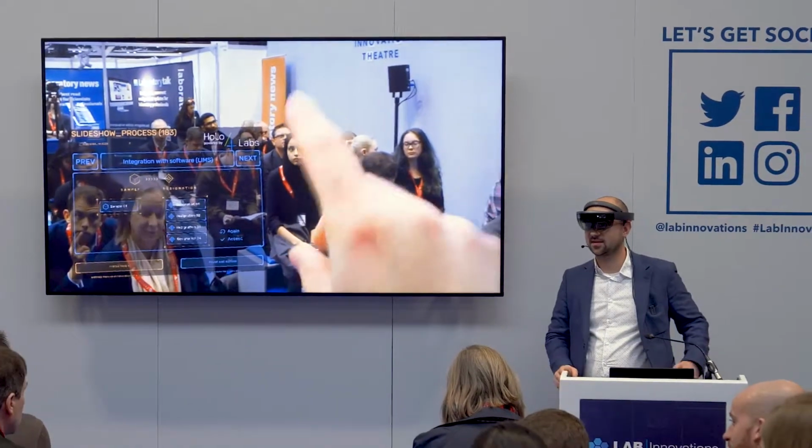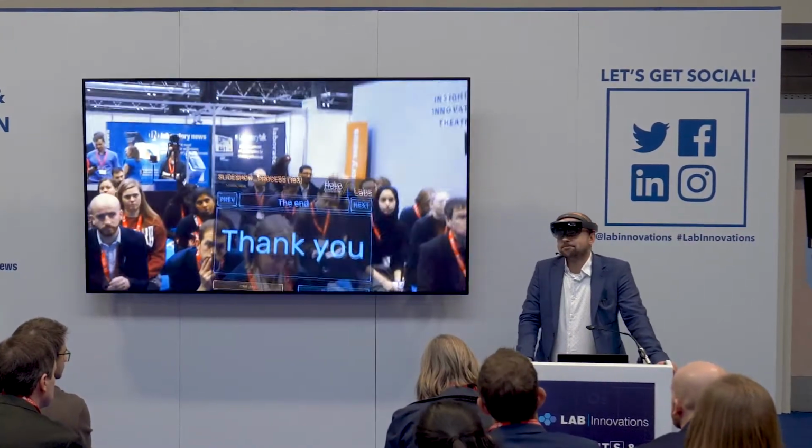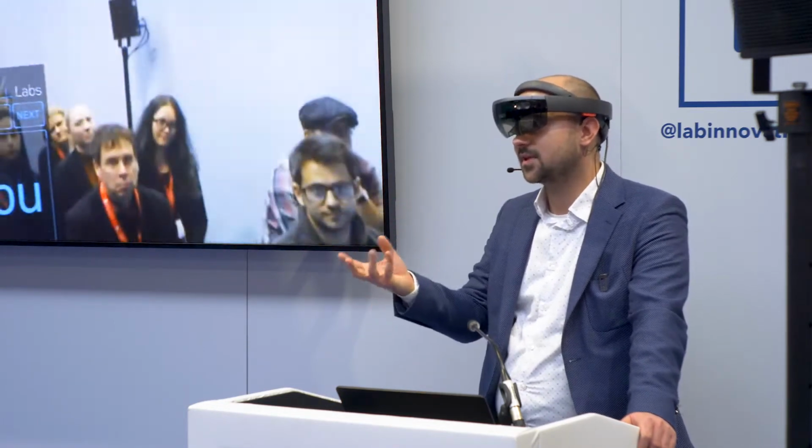Please. Does it work with lab safety glasses? The HoloLens glasses are certified as safety glasses, with additional glasses in front of you, if you are able to put something here. But it's a kind of big device, so it can be a problem.